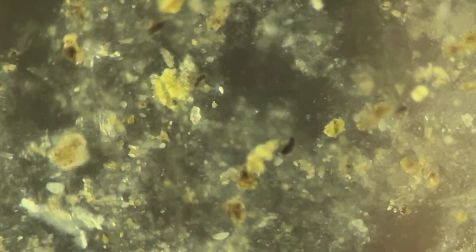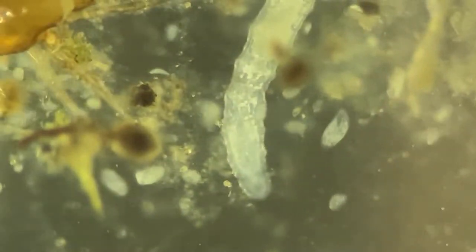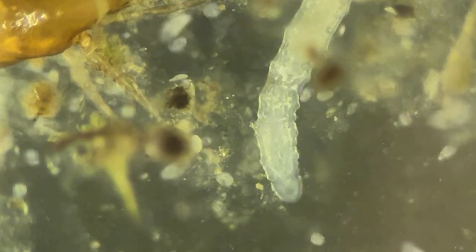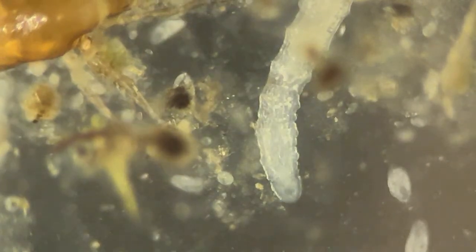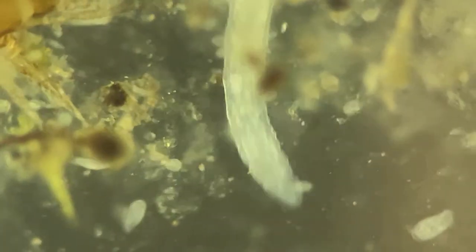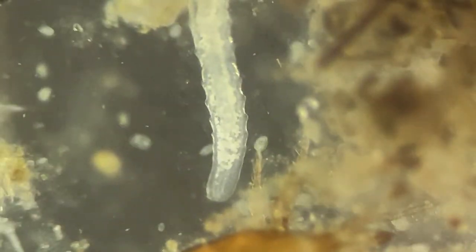Now, I'll just let the camera settle on one small portion while I do some more. Okay, here, something interesting. You see that whitish jelly hanging, that worm thing? What we'll do is we'll try to follow the body of the worm. And then you can see the eggs.